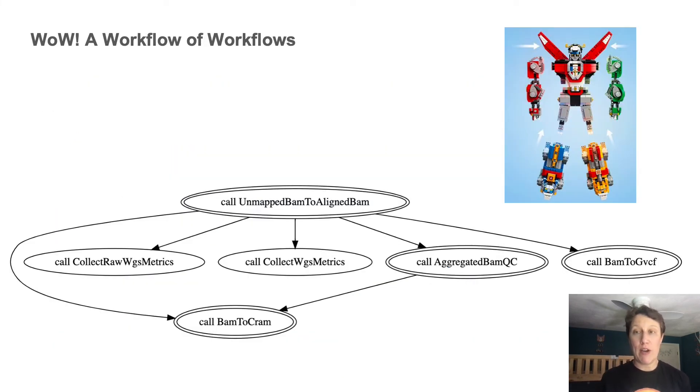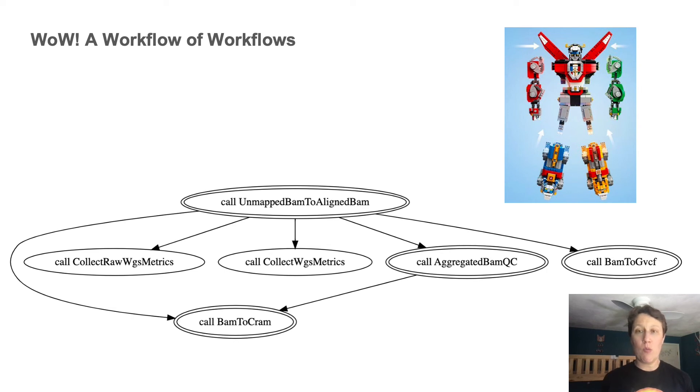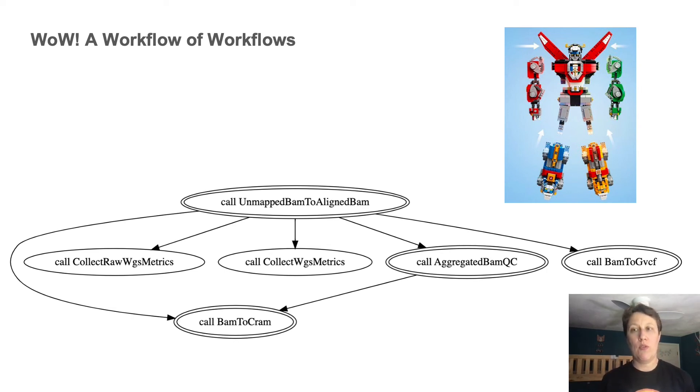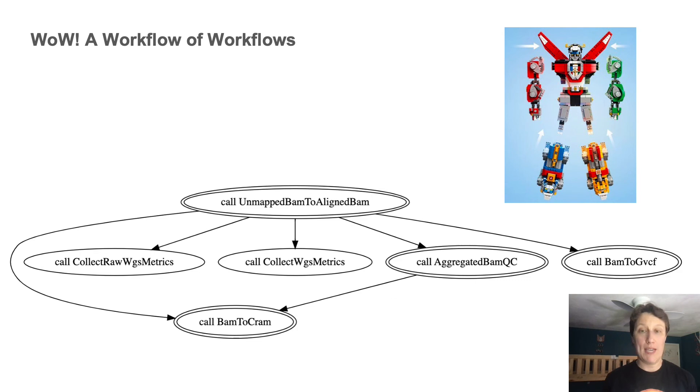Generating the graph diagram still works. So this is what it looks like when you run womtool graph on the top level workflow. And you see the double walled ovals, those represent calls to sub workflows, while single walled ovals are still regular calls to tasks.